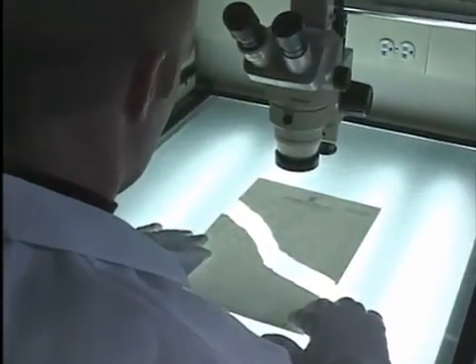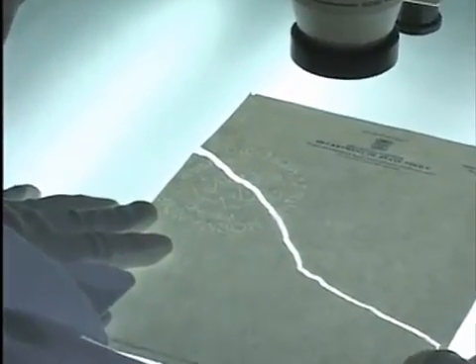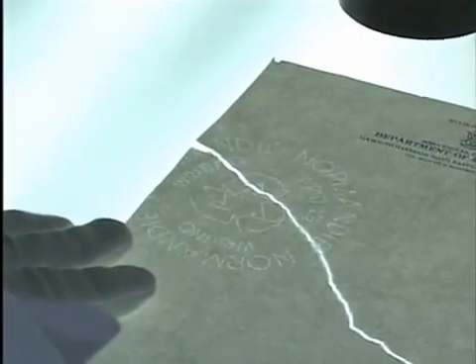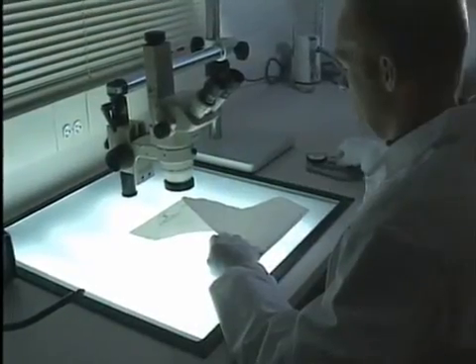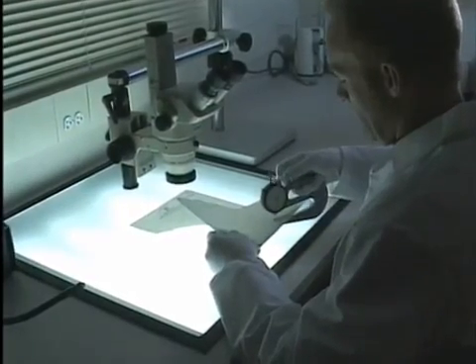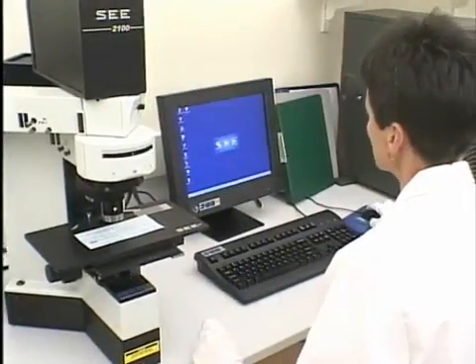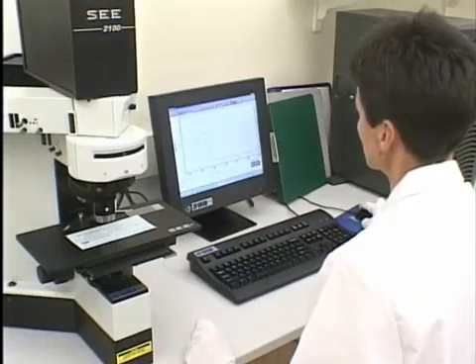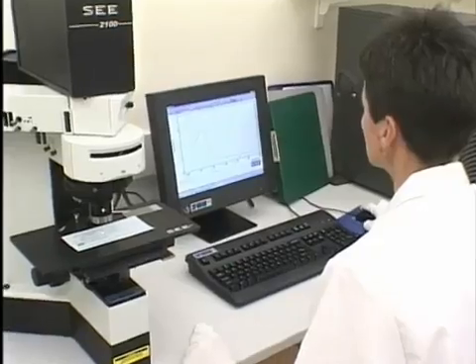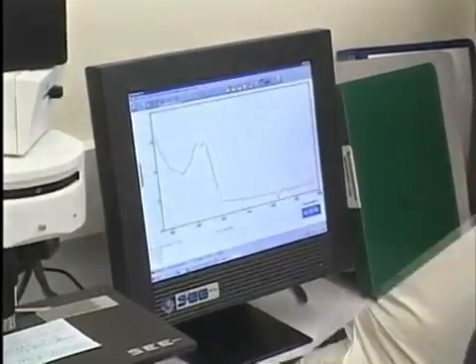Matching the tear edge of torn paper on which the writing was produced may link a suspect to a criminal activity. Watermarks on the paper, as well as other manufacturing characteristics, may be examined to determine if the document is genuine. Stock and bond certificates, or checks, for example, may look the same in all aspects except for these structural characteristics. The microspectrophotometer is one instrument used to help determine the authenticity of a document. The instrument measures light in the visible and ultraviolet regions that can be used for information about the inks and papers of known samples compared to question ones.